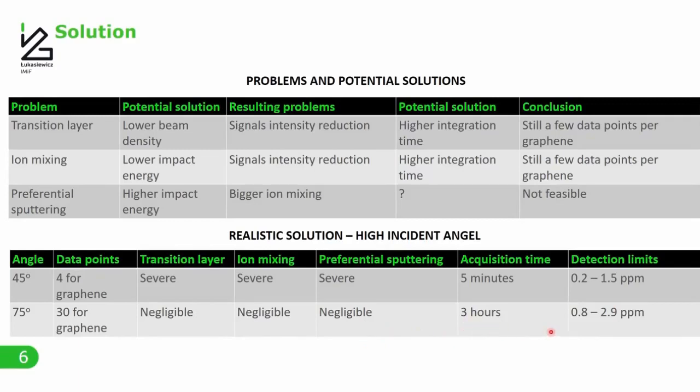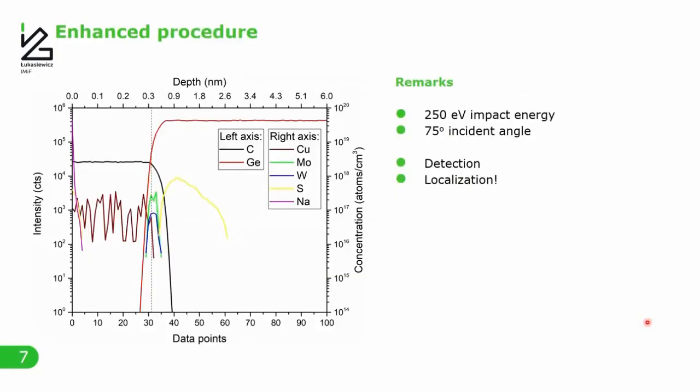So as you see, the previous depth profile was obtained within 5 minutes and the enhanced one in 3 hours. However, please note that the actual detection limits are getting just a little bit worse. So how does it look for the enhanced procedure? Here's the depth profile now.